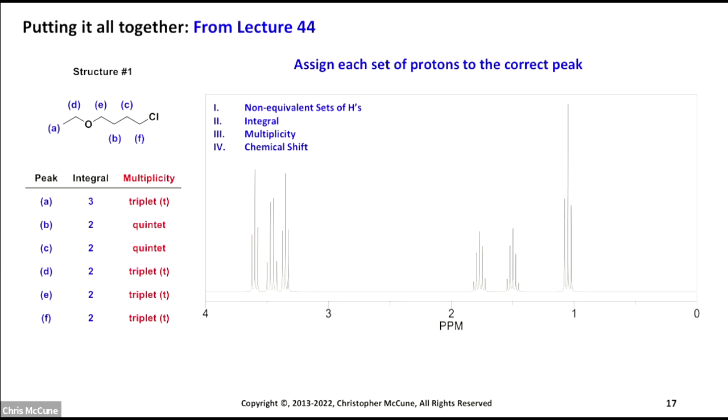And so you'd want to think about where those triplets fall in line. We only have one of these should be a quartet. So let's fix this. So D should be a quartet, not a triplet. So D is kind of helpful because that's the only quartet we have. So we know exactly where to put E or D. So this is D here because that's the quartet.